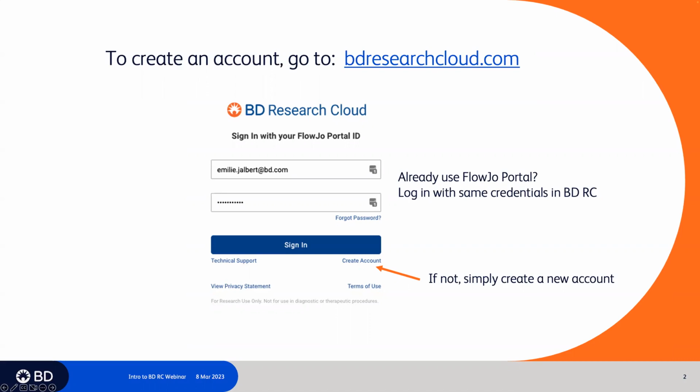We do have plans to open up in other regions, but we haven't done that just yet. We have to figure out all the paperwork and such. So right now it is restricted. Yeah, sad. I'm sorry to hear that. But you know, this is a good introduction regardless. And you can always contact your local BD rep and let them know that there's interest in Brazil to get that there.